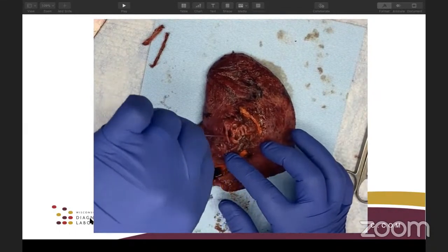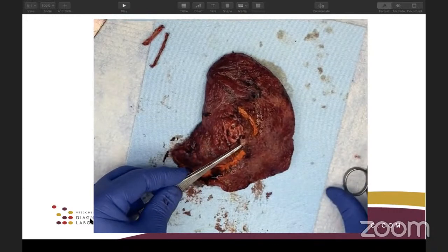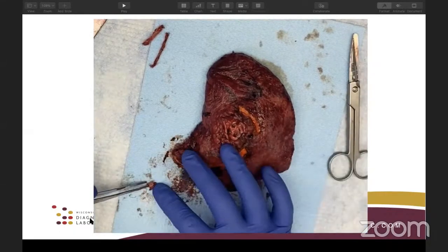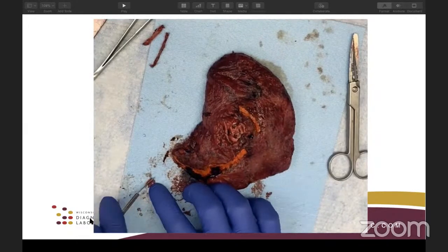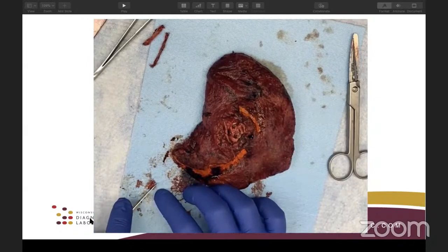All right, now we're going to look at the vessel margins. There's one. I trim that close to the staple line, and then I can cut it again right at the staple line with my scalpel. And then the same way, the true margin goes down in the cassette.